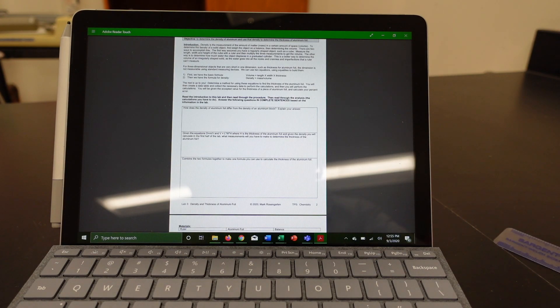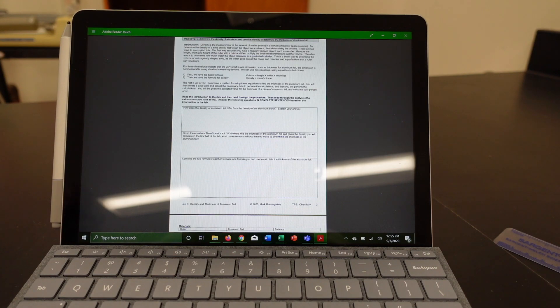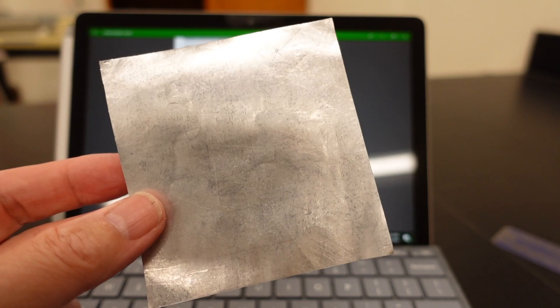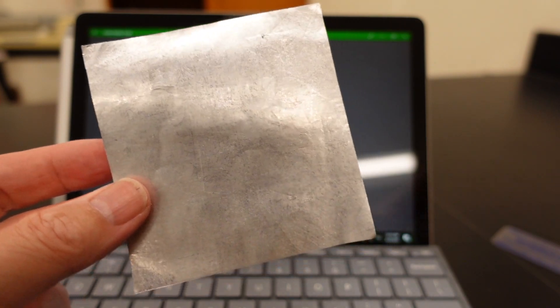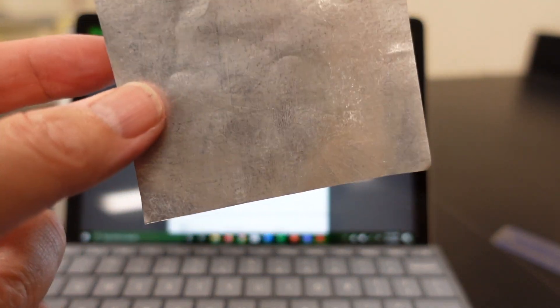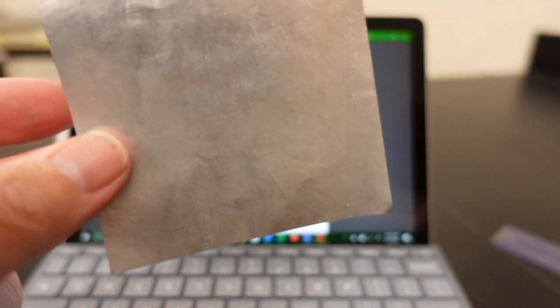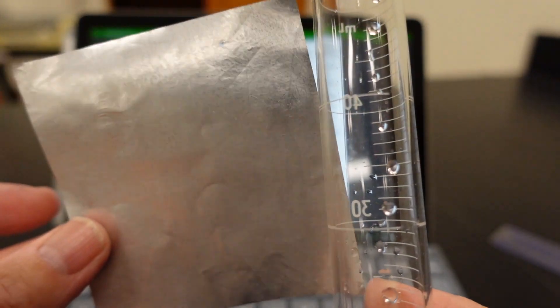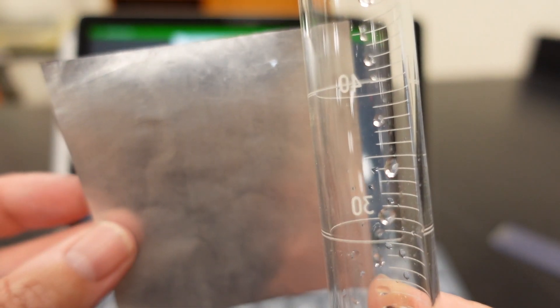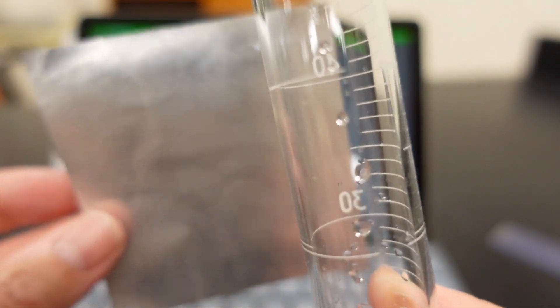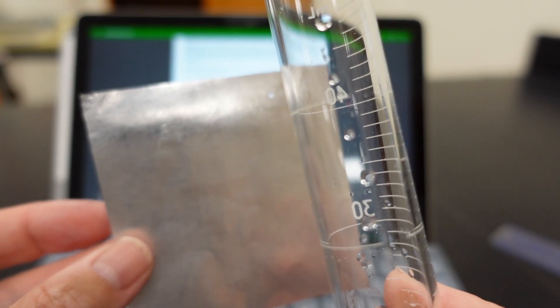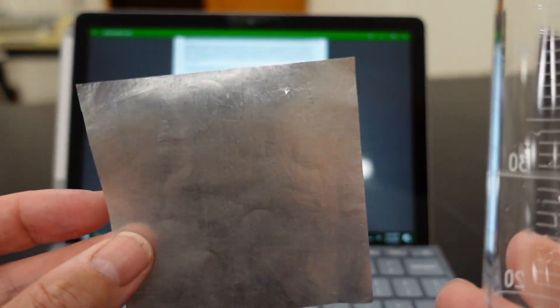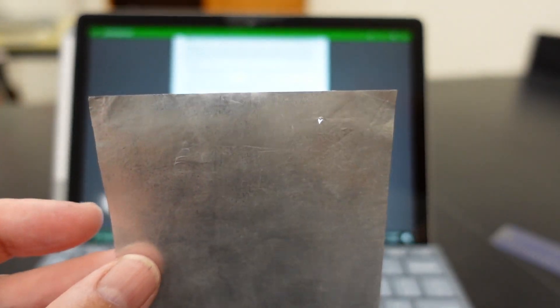Now here's one clue. You will not be allowed to bend, fold, crumple this piece of aluminum foil, which means getting volume via water displacement is strictly forbidden. You cannot do water displacement on this for two reasons. One, you'll destroy the piece of aluminum foil.